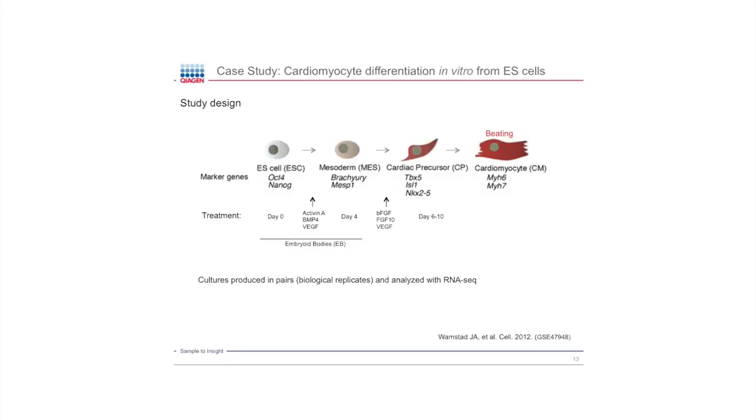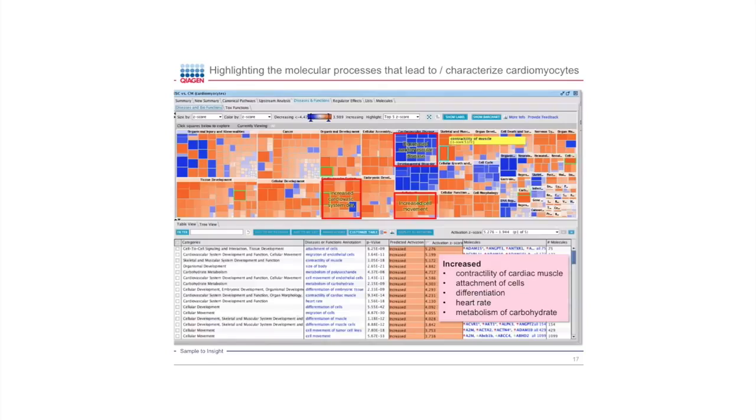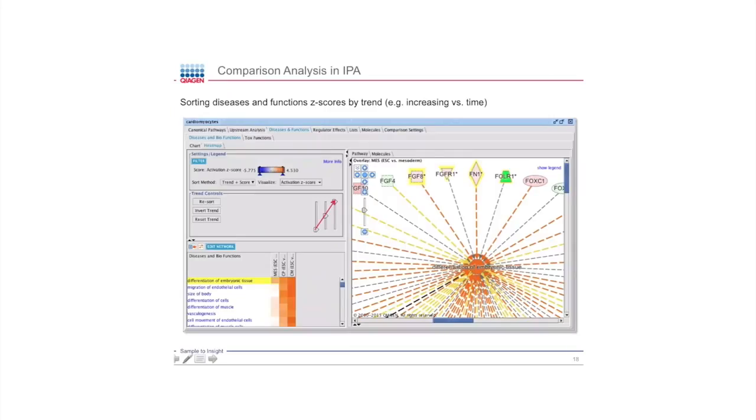This was a question by Suraj. What do dotted lines mean in the previous slide? Oh, okay. The dashed or dotted lines indicate an interaction of some sort, but it's not a direct interaction. In other words, it's not a binding kind of relationship. There's no physical interaction, and especially in every case where there are genes and a function like that, there's never going to be a direct line.